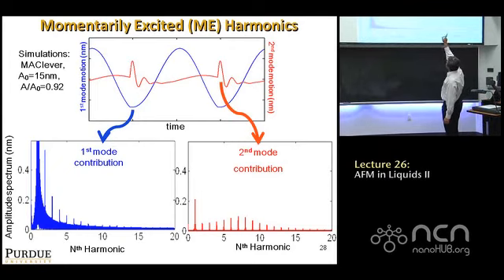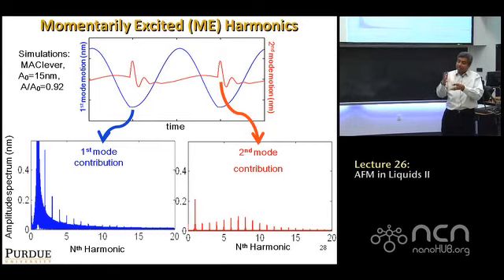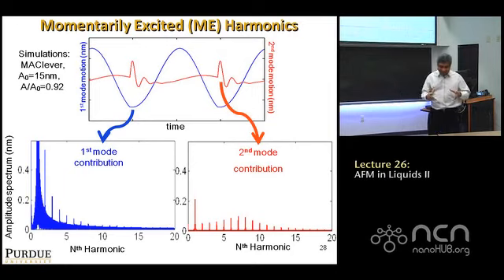The blue is how the first eigenmode oscillates as you tap on the sample. The red is how the second eigenmode is moving, that each time you tap, it rings and dies out, rings and dies out. And so what we're trying to capture is a little ringing of the red curve. And the more it is, the stiffer the sample, the less it is, the softer the sample, right? How do you get the sound is the question. We're not going to get the sound, right? It's just an analogy with the basketball because, in that case, the frequencies are low enough that you can actually observe it.